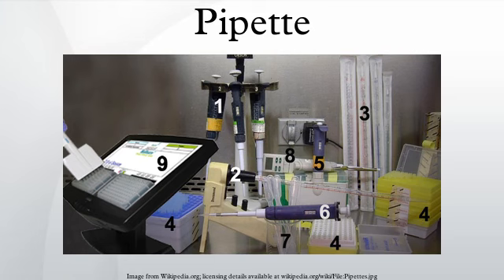Many pipette types work by creating a partial vacuum above the liquid holding chamber and selectively releasing this vacuum to draw up and dispense liquid. Measurement accuracy varies greatly depending on the style.